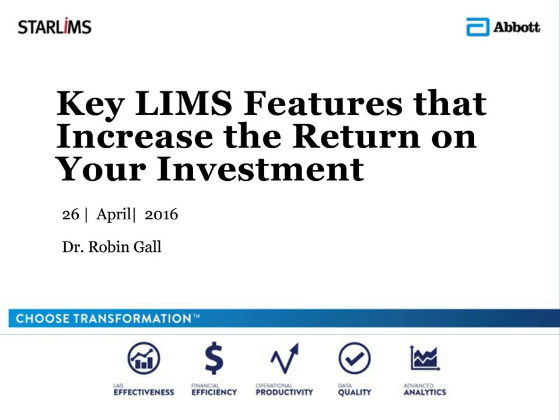This investment that you're going to make when you purchase a laboratory information management system is one that you're going to have for probably 7 to 10 years. So you'll want to make sure that you choose a product that's going to fit the needs of your agency, not just today, but also into the future.